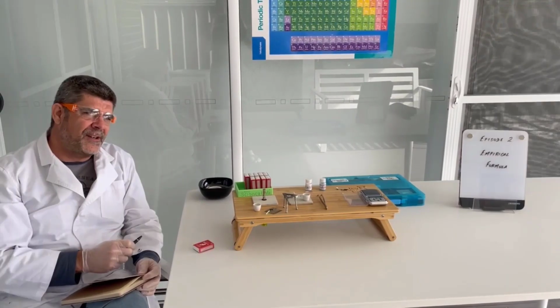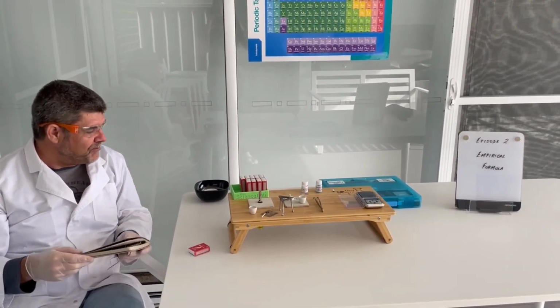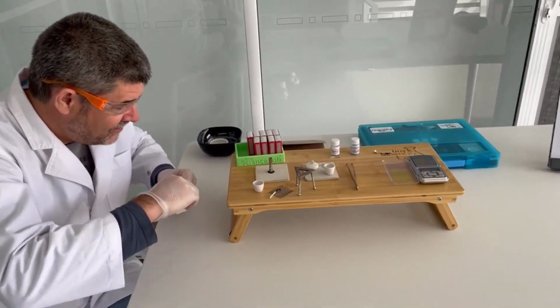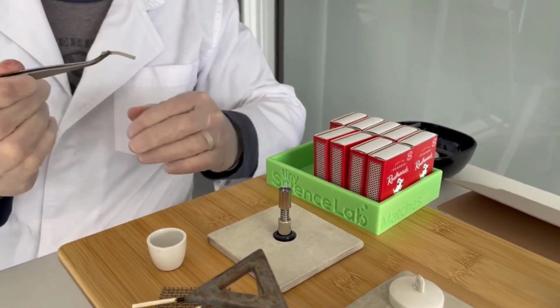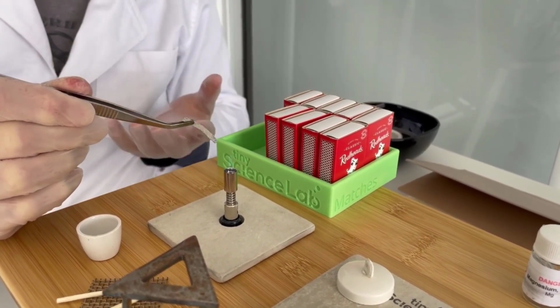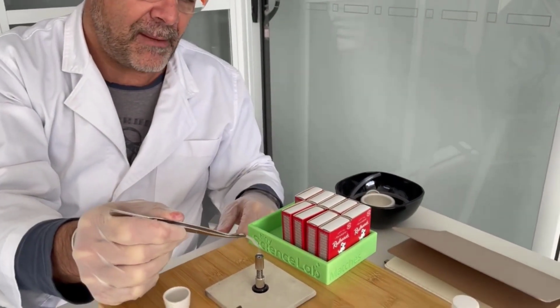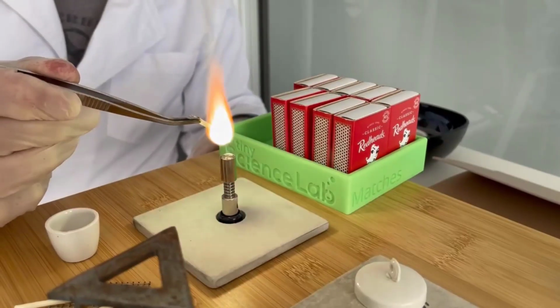What's one of the favourite experiments that everybody loves to do? Burning magnesium. So let's have a quick look at that one. Here's some magnesium from episode 1. I'm going to see if we can heat this magnesium in order to create a chemical reaction between the magnesium, which we know is an active metal, and the oxygen in the atmosphere. In order to do that, I need to heat it up to start the reaction.